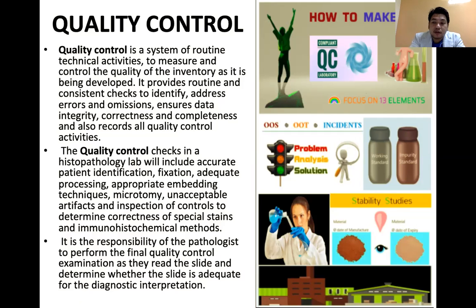Reagents, okay? You have to check every reagent if it is still appropriate for usage. There are reagents, class, that are not yet expired but can no longer be used. Okay? They have either decolorized or changed color, or precipitated, and can cause formation of artifacts. So it can no longer be used for the histopath lab. Okay?